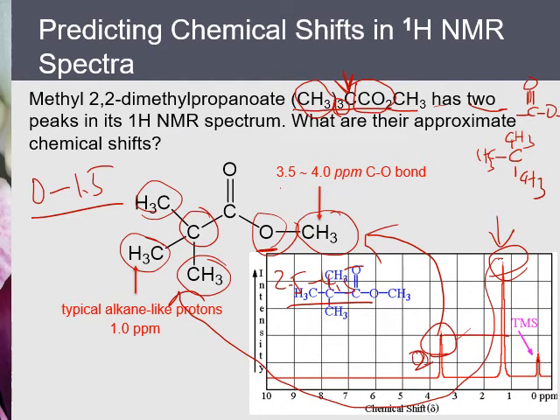It's about 3 times the intensity, and this is because of the number of hydrogens here compared with this one, the ratio is about 9 to 3, so 3 to 1. In other words, the intensity of these two peaks also tells you the relative number of these two types of hydrogens. And that's another topic we're going to talk about next.